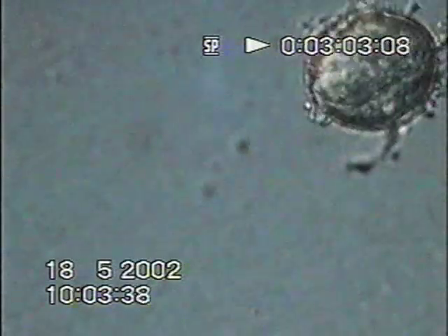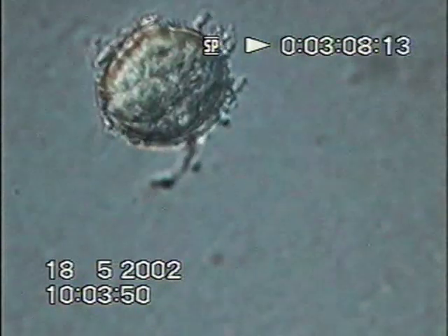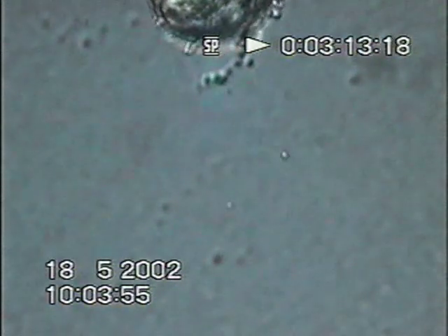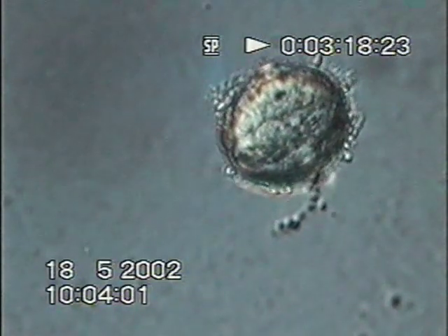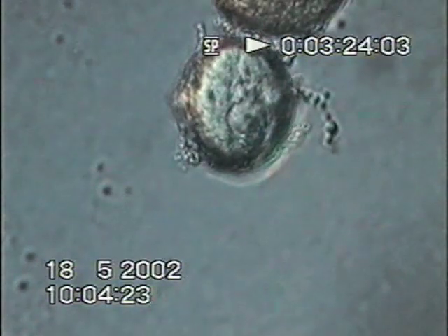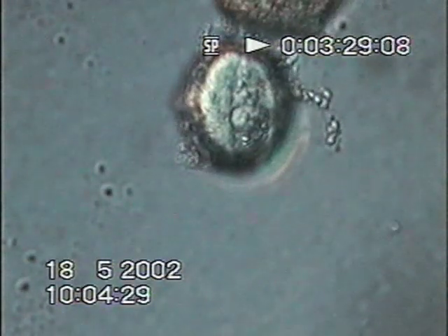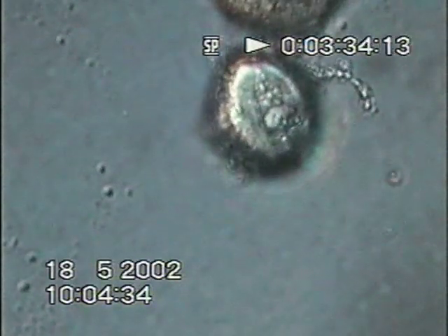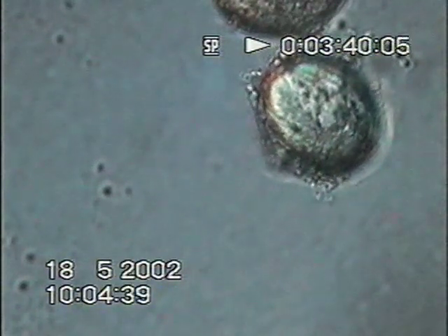Of the activity, a bit of activity around chestnut pollen. Their long strings have accumulated in about 15 minutes. It's really difficult to know what is going on here. That string of organisms, granules or whatever, and of course the motile orbs, we don't know what they're doing.